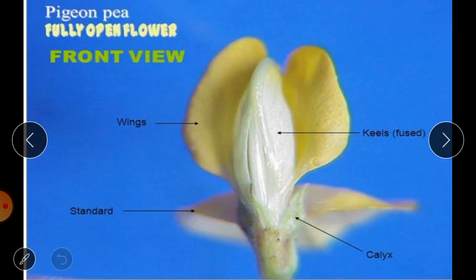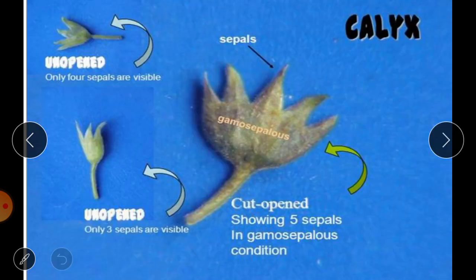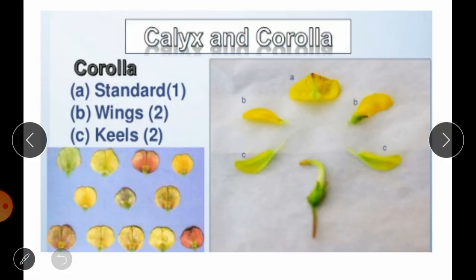Here you can see a view of the pigeon pea flower. The calyx forms a tube surrounding the other parts. The largest petal present on the outermost side is called the standard. Inside the standard are two petals called wings, and inside those wings are two fused petals called the keel. The calyx shows only three or four sepals when unopened, but if you cut it open you can see there are five sepals in gamosepalous — fused — condition.